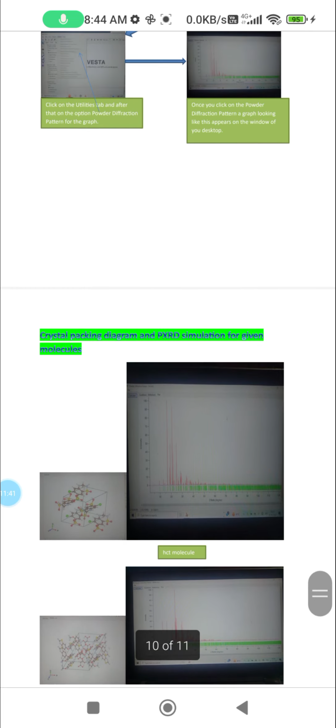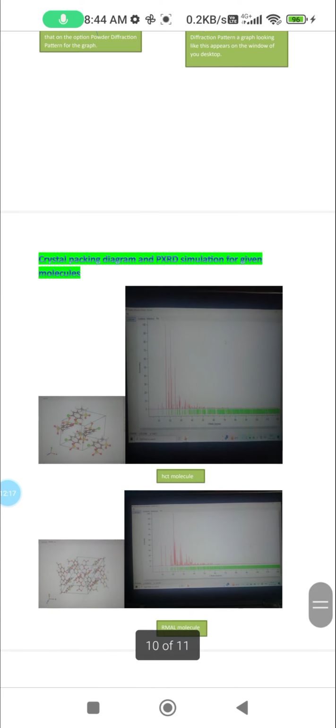Once you use OLEX, you must know all the commands. There were like 200-300 commands inside OLEX2. You can use any command to make your structure even better if you know each command very well. I know only some commands, so it is new to me, so I have done my best using these softwares. So with Vesta and PXRD simulation, we just created this crystal packing diagram.